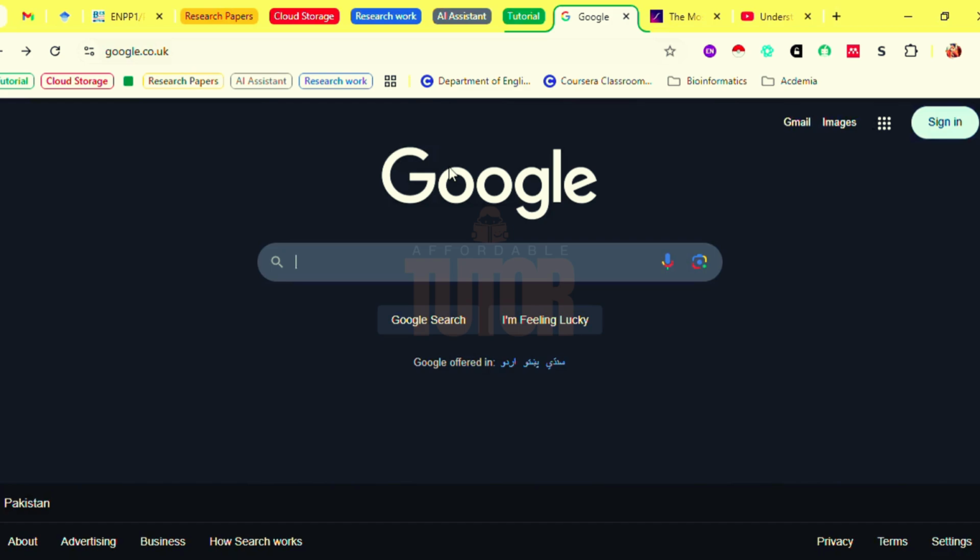In today's video, we are going to learn how you can find RS IDs or single nucleotide polymorphisms for your gene of interest. For the purpose, we will be using the gnomAD database, which is called the Genome Aggregation Database, that brings together exomes and whole genome sequencing data from several studies reported in different databases and in different projects on the internet.